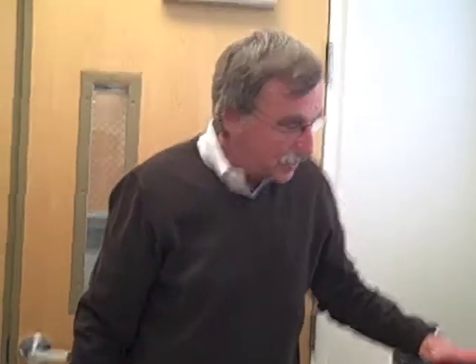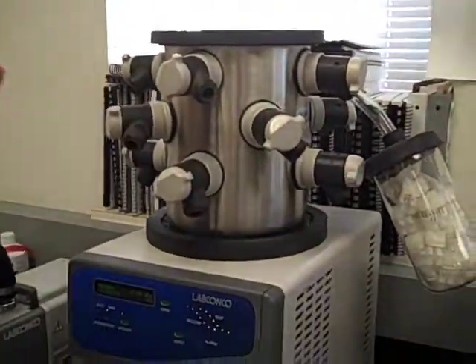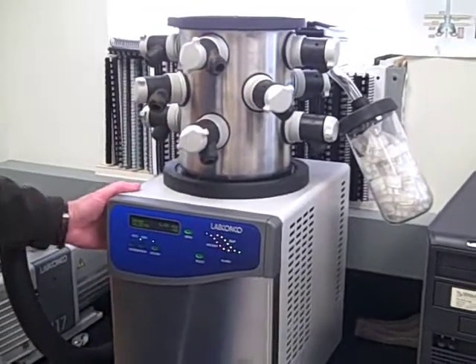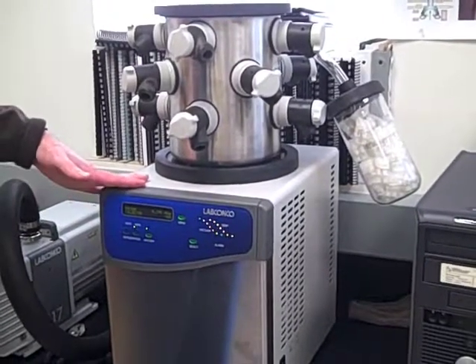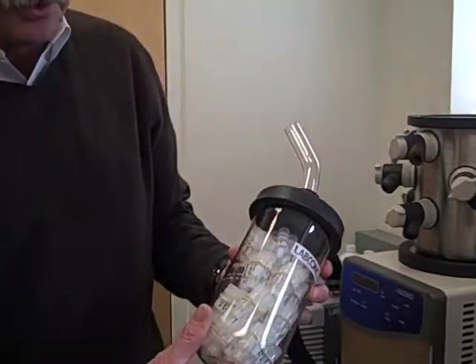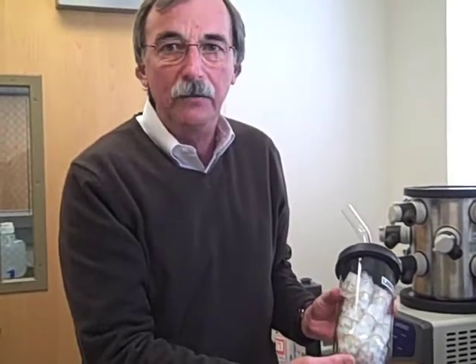The final step in our purification process is to freeze dry the protein that we have, and this is called a lyophilizer or a freeze dryer. Same principle as freeze-dried coffee. We freeze the samples in small vials, and then under vacuum and low temperature, this is minus 48 degrees centigrade right now, it dries or removes the water overnight. And we have our purified protein in small aliquots that can then be sent off for analysis.